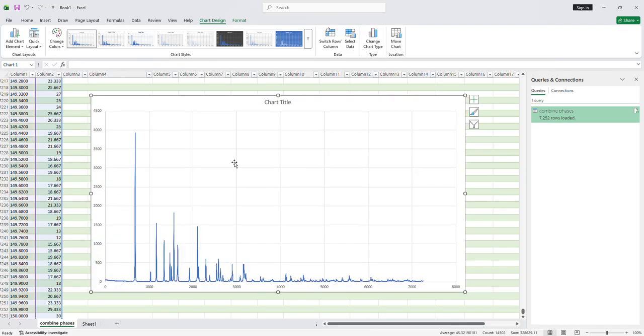Now in Excel, it is easier for you to modify the name, you label everything from here. So this is how you edit your XRD data from EVA and from Microsoft Word and Excel. Okay, thank you very much.